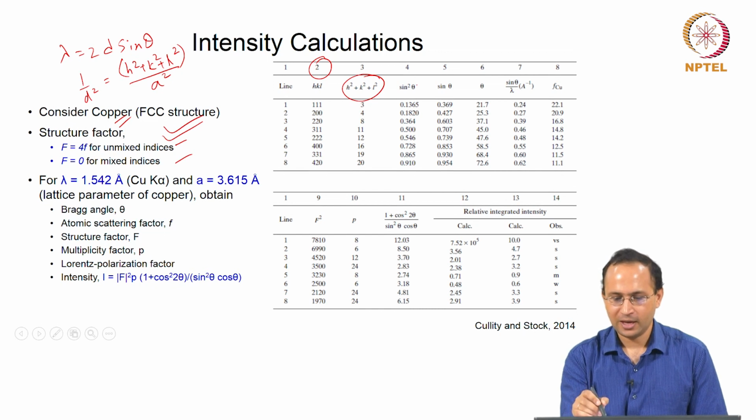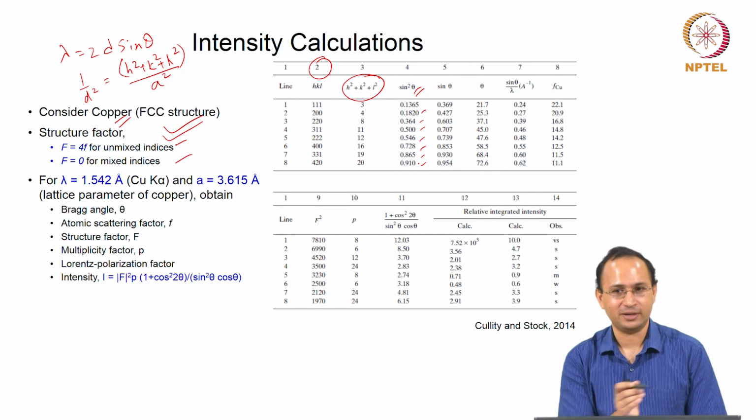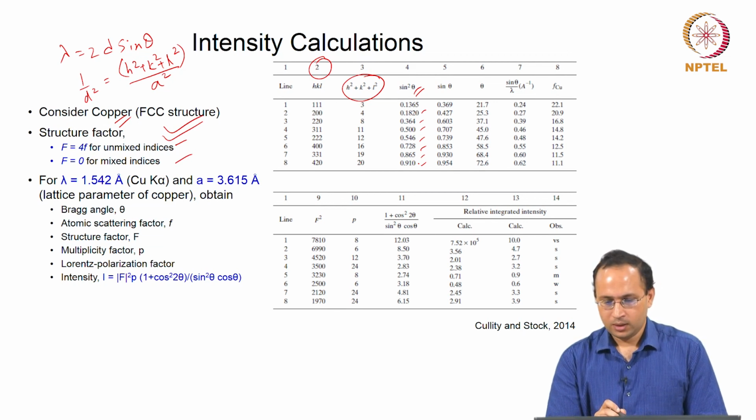Now we can calculate the sin square theta, that is given here. And you already know, you have a diffraction pattern, so you know what the values are.